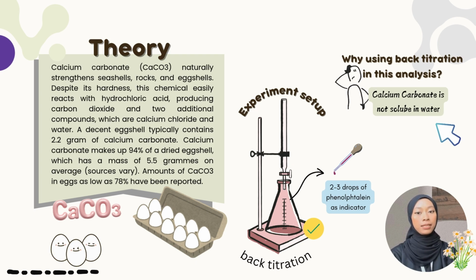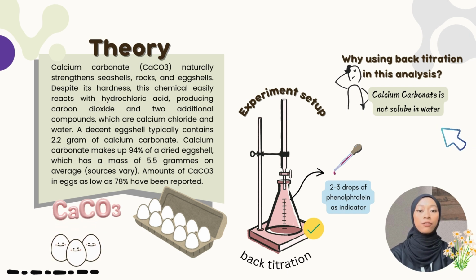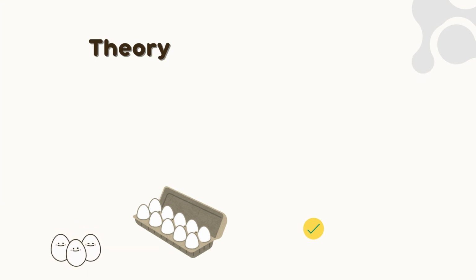Therefore, to determine the percentage of calcium carbonate in eggshells, we are going to apply the back titration method for this volumetric analysis. Why is back titration applied? Well, in this case, calcium carbonate is insoluble in water and eggshells may contain other impurities.